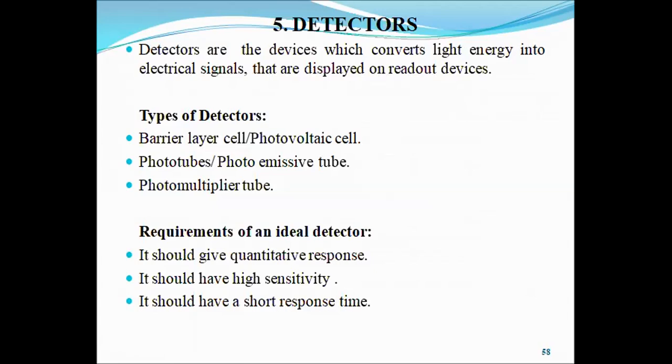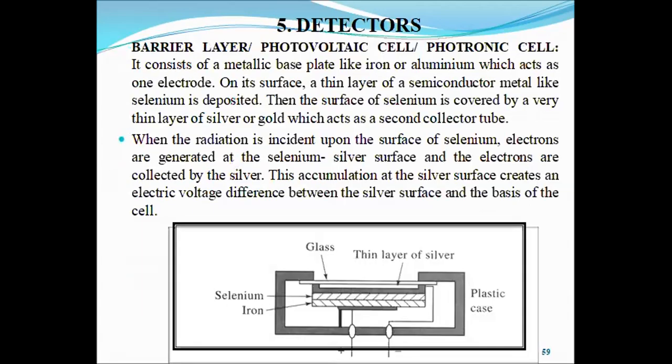There are some requirements of the detector. It should give a quantitative response. It should have very high sensitivity. It should have a short response time. It should not take much time to give the spectrum. Now, we'll see one by one all the three types of detectors.